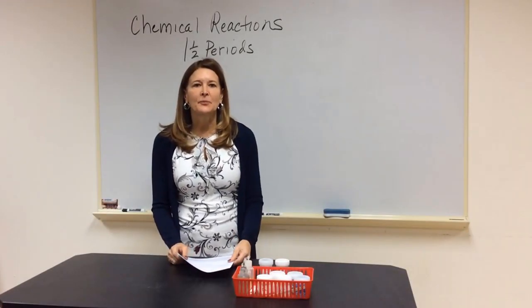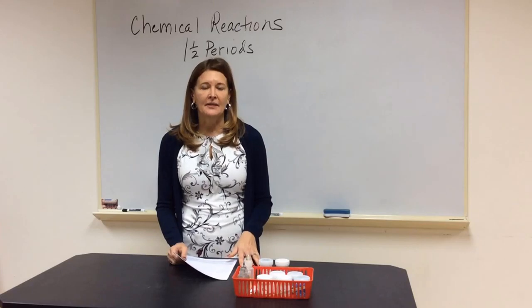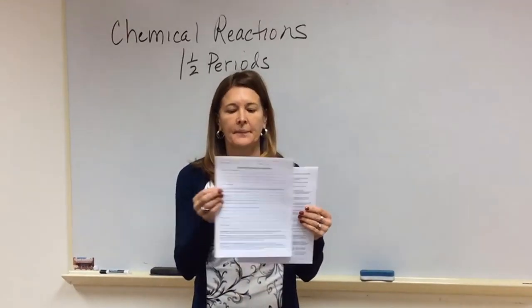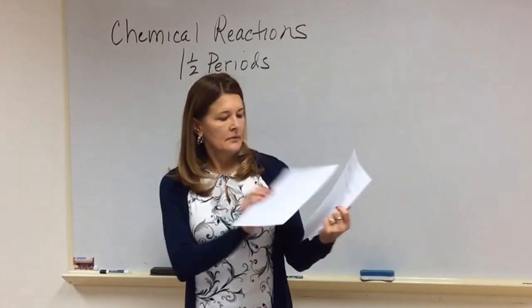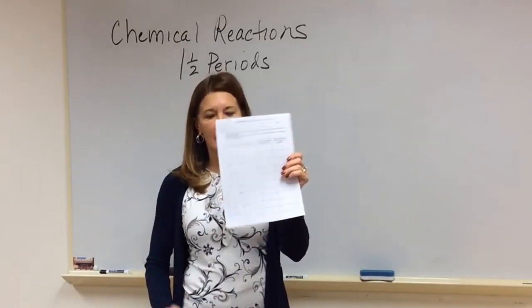Hello, today's pre-lab talk is on chemical reactions. You have approximately a period and a half for this lab. By now you should have obtained a paper copy of the lab that looks like this, with some pre-lab, a procedure page, a data collection page for observations, and then a data collection table.